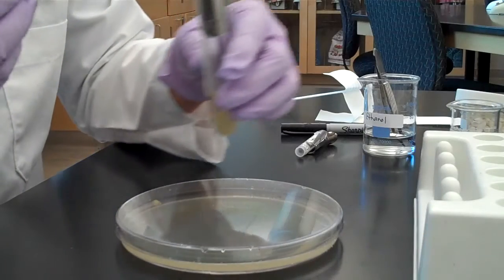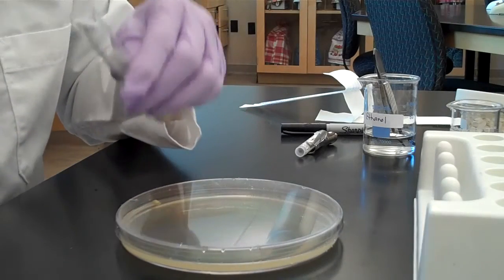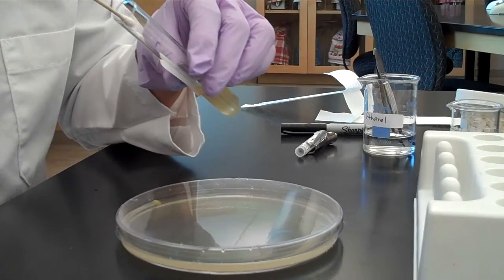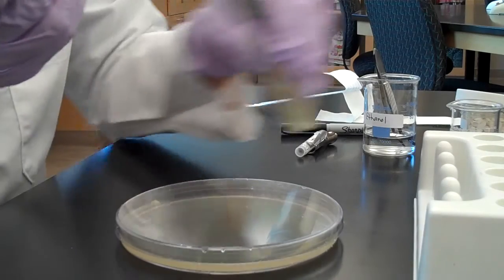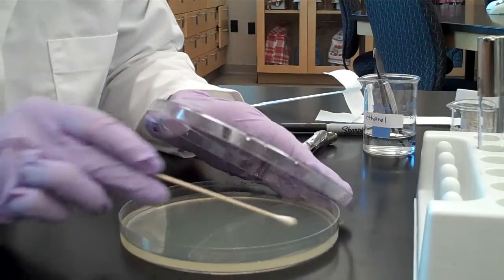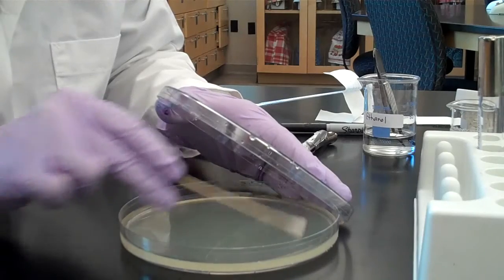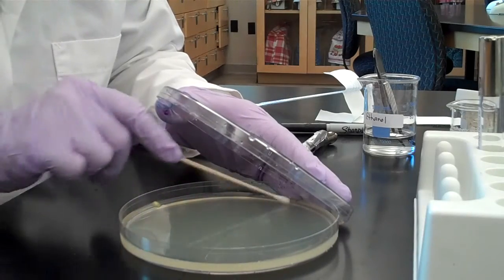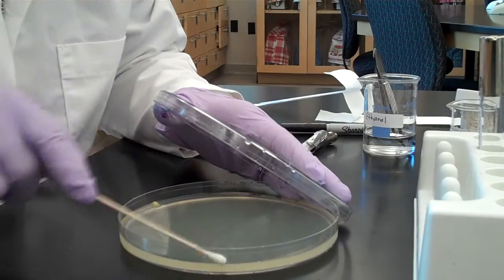Dip the sterile swab into your culture, and then swab the entire surface of the agar plate. Go back and forth, making sure you cover every little bit of that agar with the bacteria.